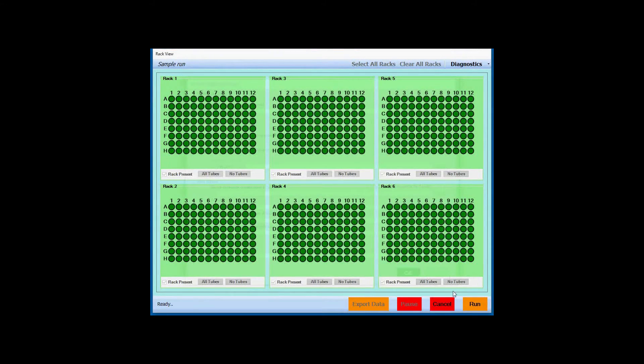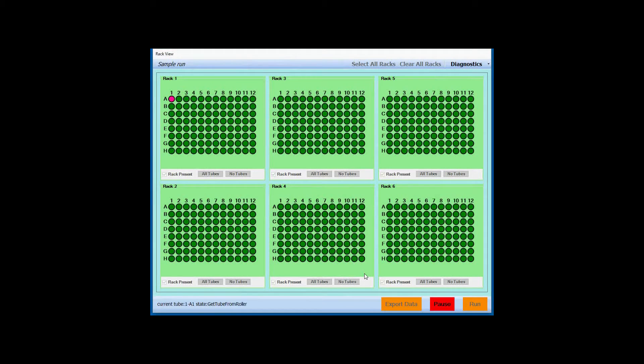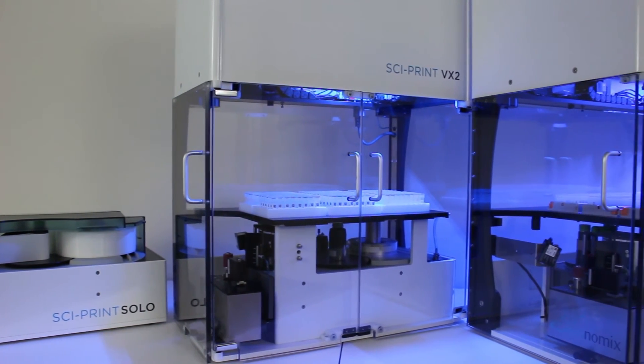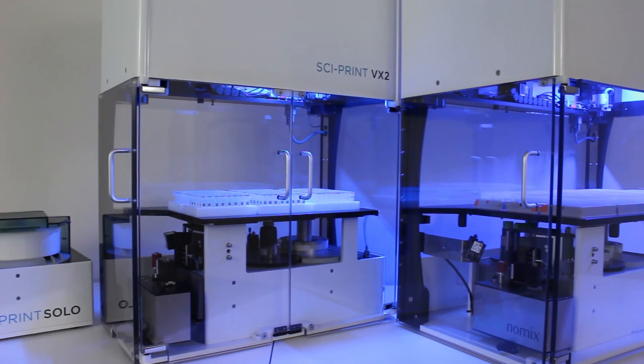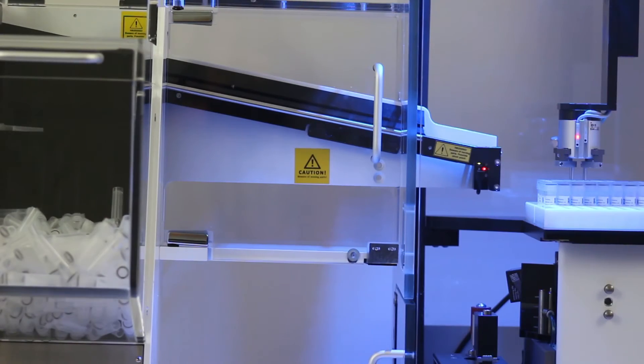Labeling throughput of the SciPrint VX series is approximately 425 tubes per hour. In a recent customer survey, 53% of end users stated their vial labelers saved them between 5 and 20 hours per week on average, while nearly 10% claimed more than 20 hours per week on average in time savings.